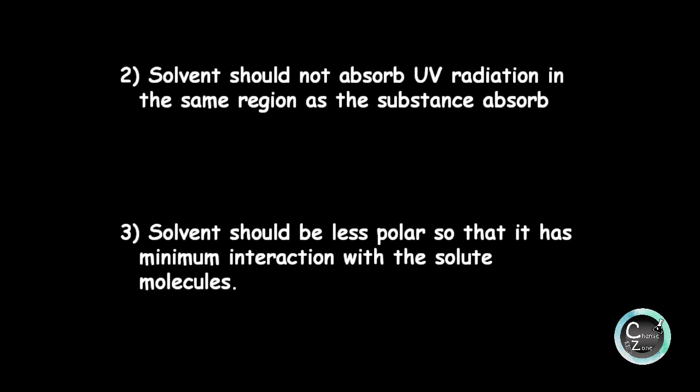But if the solvent is polar and can form hydrogen bonds with the solutes, then we will not get a fine spectrum. The spectrum will be broadened. So these are the criteria based on which a solvent is selected for UV spectroscopy.